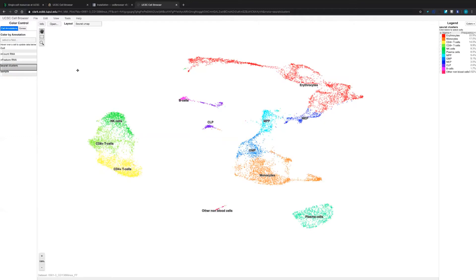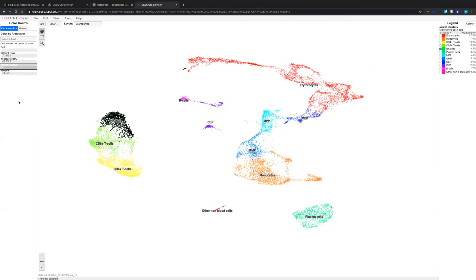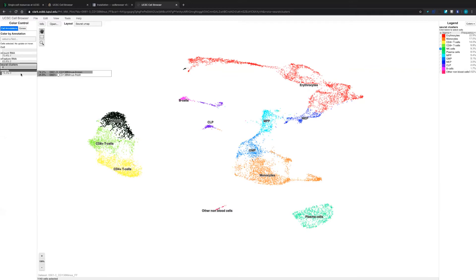The second thing we can do is select one cluster or one cell type and check the difference. For example, if we are interested in NK cells, we can select NK cells from the color legend panel. Then the left panel will show some numbers. If you move your mouse over, you can check that these NK cells are from cluster four, and it will give you the different percentage of cells from one sample versus another.